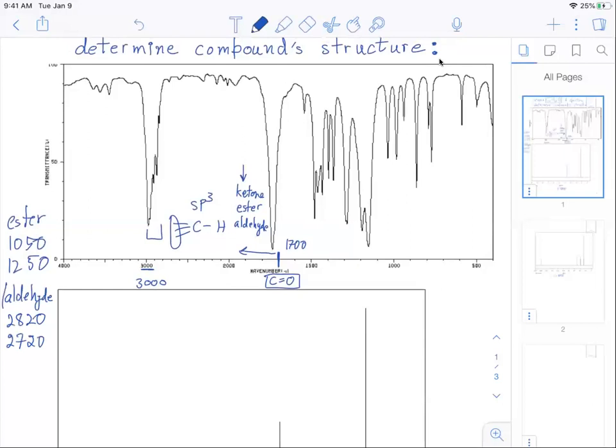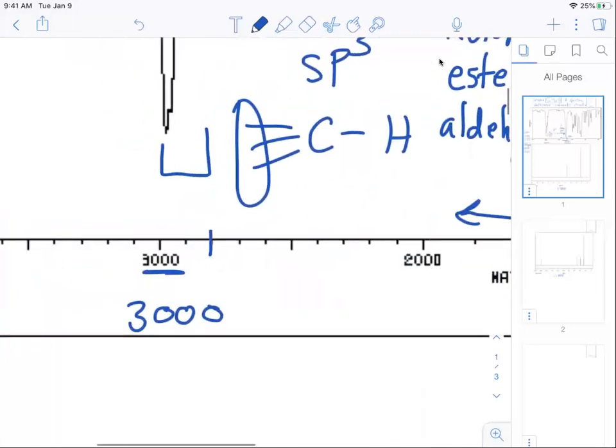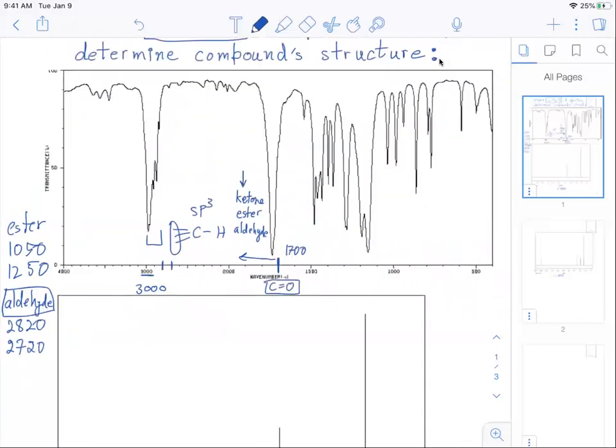So let's start with aldehyde. If we go to this area there's roughly 2800, there's roughly 2700, good enough for 2820, 2720. I'm just going to draw a line up and see what goes. I really don't see any peaks here so it's not an aldehyde. This I can rule out with a great degree of confidence.